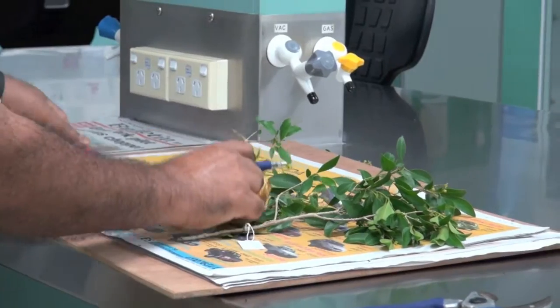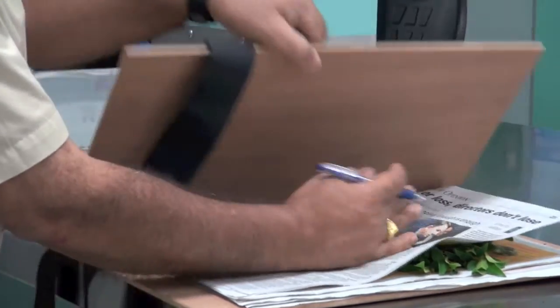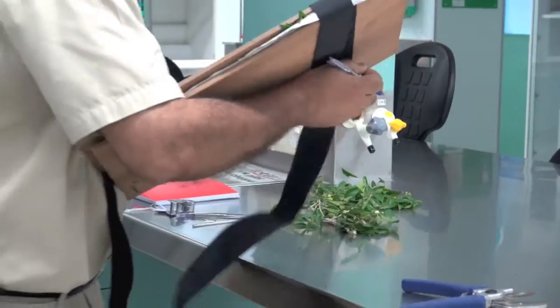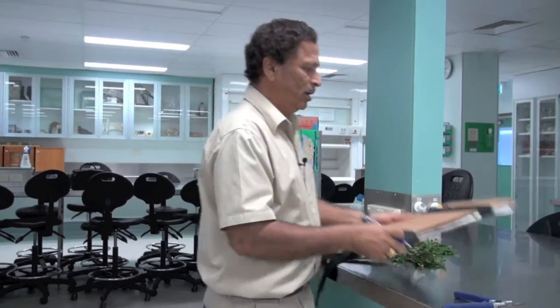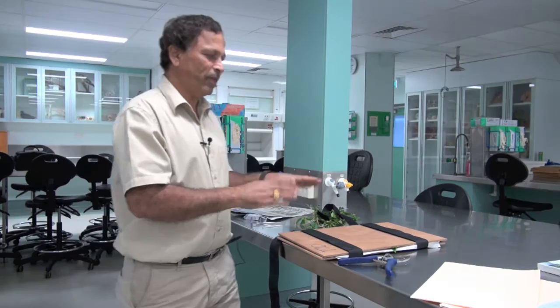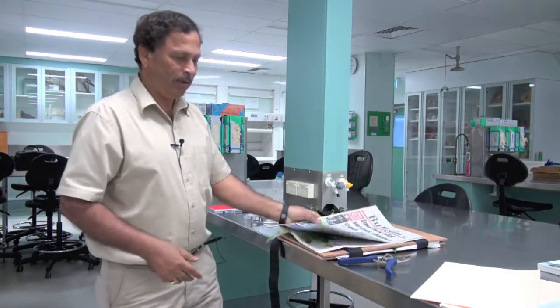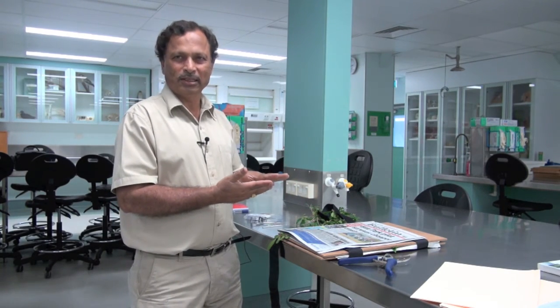Then you cover this, put the sheet back, and tighten up. Take it all, put the weight so that all the samples get pressed. Every one or two days, change the paper to a new paper. Once you change it three or four times, the plant sample should be dry and you will get a very neat sample.